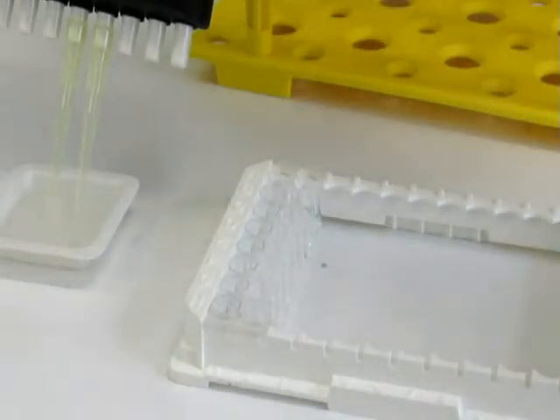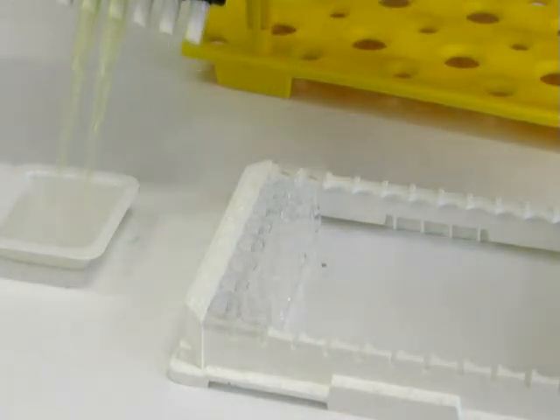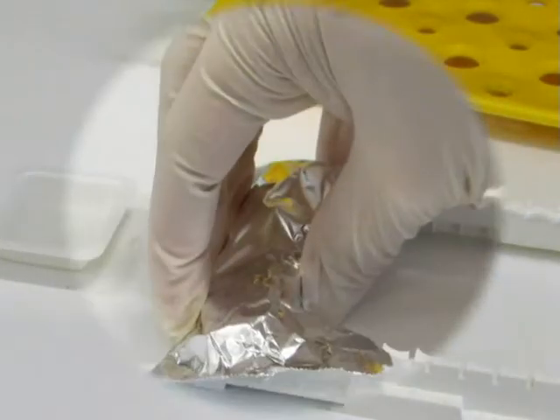Add 100 microliters of TMB to each well. Incubate in the dark without shaking according to the kit protocol. Control the blue color of the highest concentration of your standard to avoid saturation.